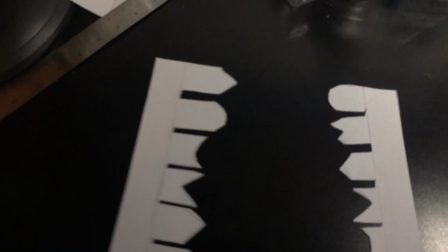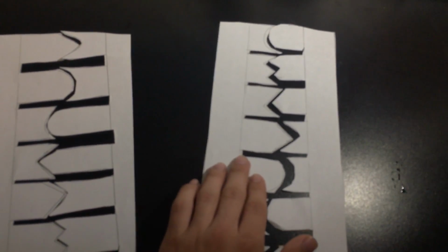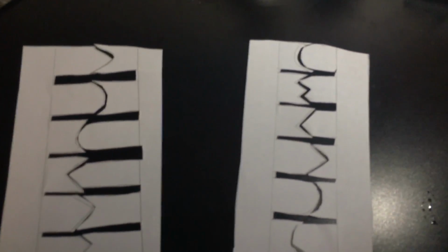It goes along, and that creates all of the matching pairs. And then we get two of those. So what happens basically is then they split apart.